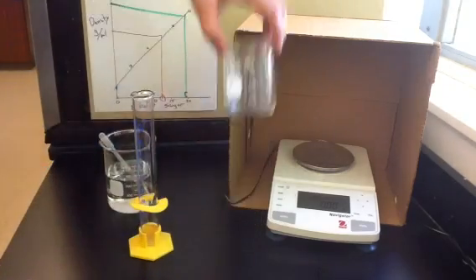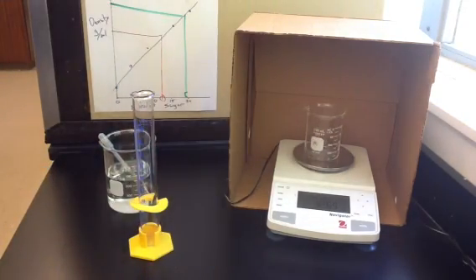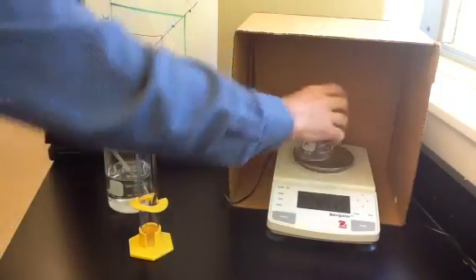To begin with, we're going to find the density of just plain water. First thing you need to do is take an empty beaker and find its mass. So we'll put that on the balance, and it's 92.65 grams. That's an important mass because we're going to need to be subtracting that from the mass of all the other solutions, or all the other measurements. So 92.65 grams for the empty beaker.